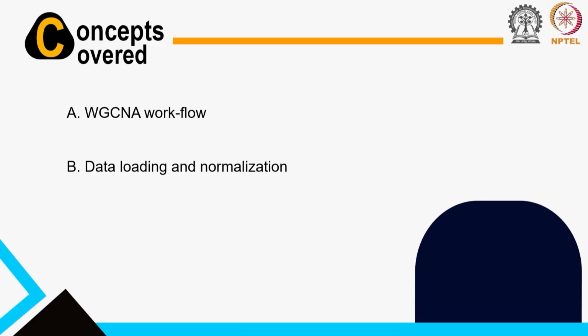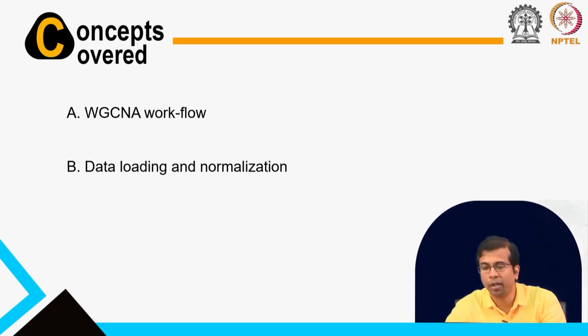So, first I would like to discuss the WGCNA workflow before we actually jump into the analysis, because it should be clear, right, what we are doing and why we are doing it. So, that is something I want to discuss first with the WGCNA workflow, and then we will do the hands on for data loading and normalization. Okay, so, we will continue the normalization part today.